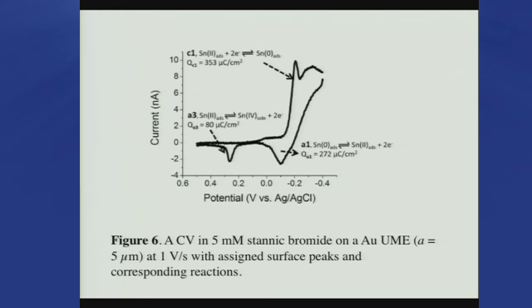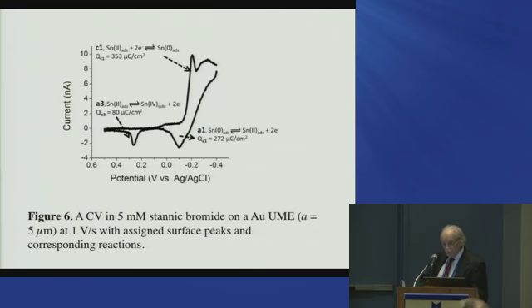These are surface reactions. I don't want to go into all the details about them. But what this is is underpotential deposition of tin. So in this crazy way, I'm making tin 4 to tin 2 on gold. But as Stan Bruckenstein studied, and we studied later, tin 0 likes gold better than it likes tin 0. And so although the next wave, the wave of tin 2 to tin 0, is over here on bulk tin, there is a monolayer of tin that forms within this wave, and that's called UPD.